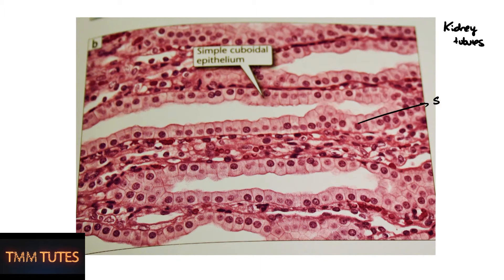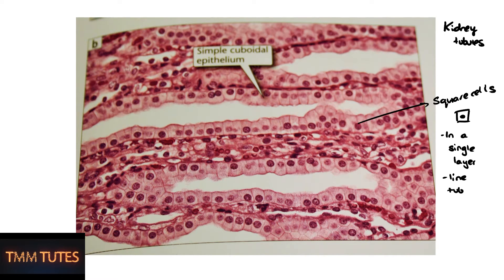Let's start with simple cuboidal epithelium. Here we've got kidney tubules — these are square cells with a central nucleus, and they line in a single layer, usually around tubules or lumens, forming a wall.